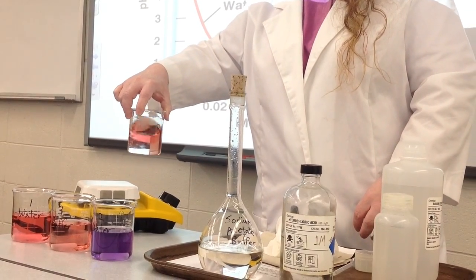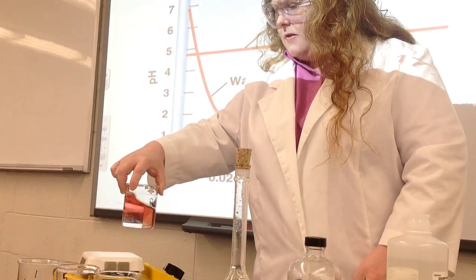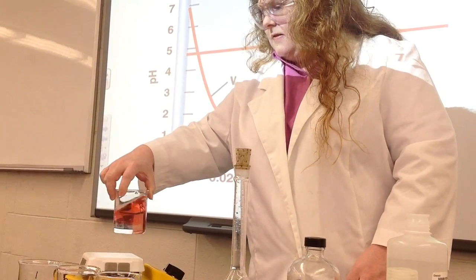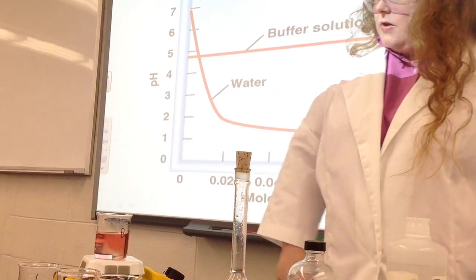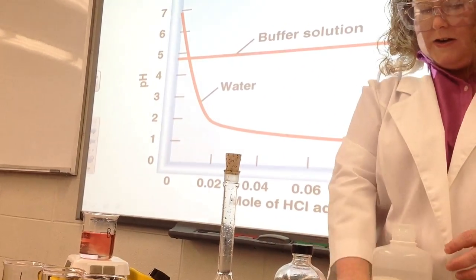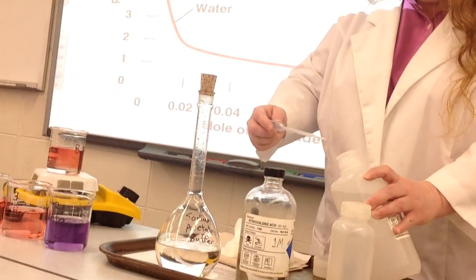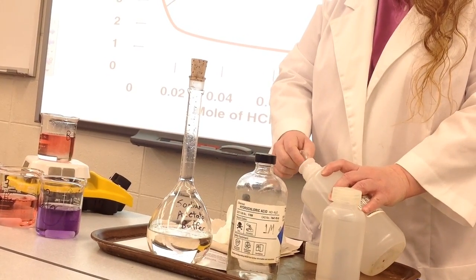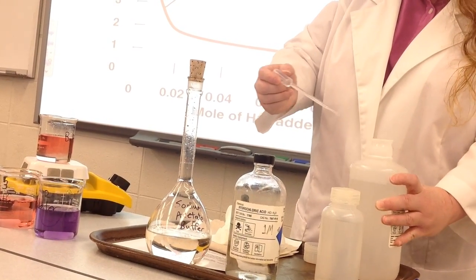Okay, so pink color should change if there's a pH change when I add the base. I'm getting it to mix without a magnetic stir bar.